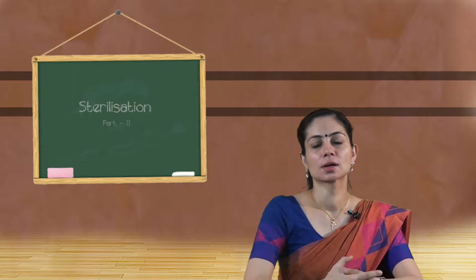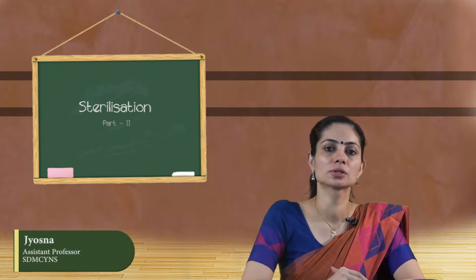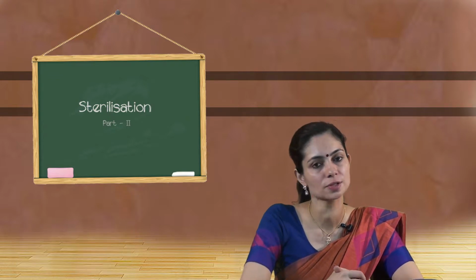Hi, this is a continuation of the sterilization chapter. In the first part, we were discussing the dry heat method of sterilization, and we started with different types of moist heat method of sterilization.